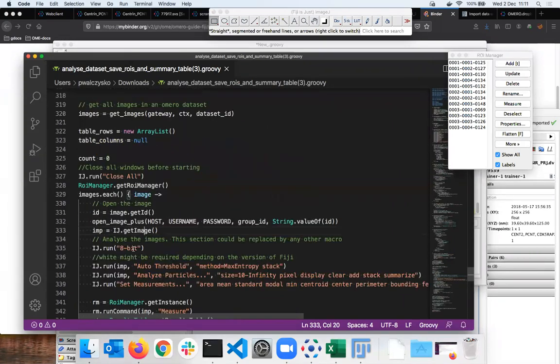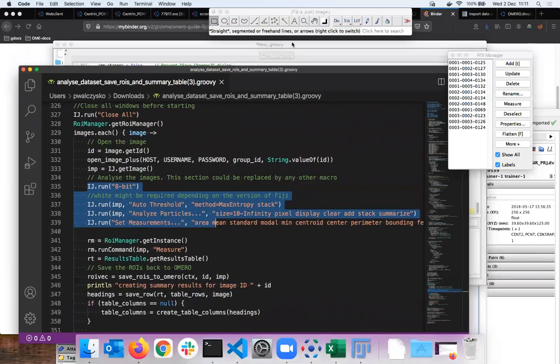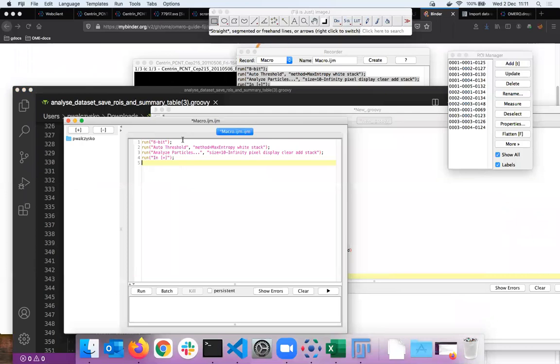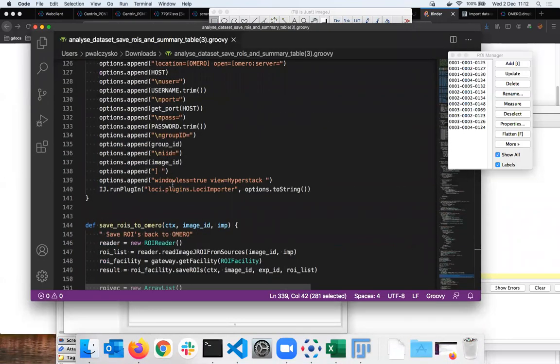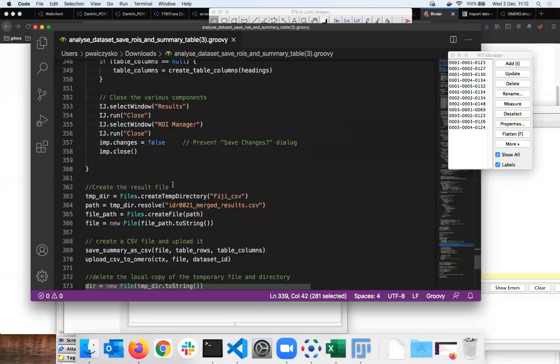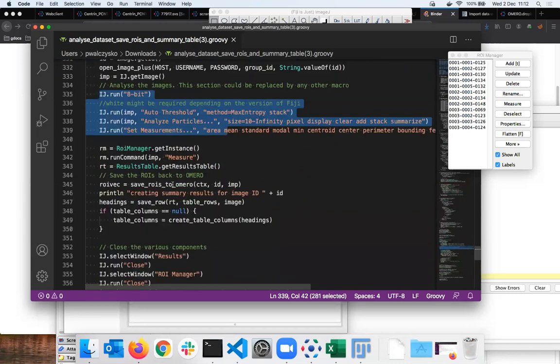And you can see here the bit which I was going through and which is recorded in the macro here in Fiji, which goes something like... Yeah, the key part there is always the same logic. You first need to connect to OMERO. You retrieve the data. In that case, open image. No, stay where you were, Peter. Go down, go down. No, you were at the core. I think going through... no, what you were showing, just stick there.